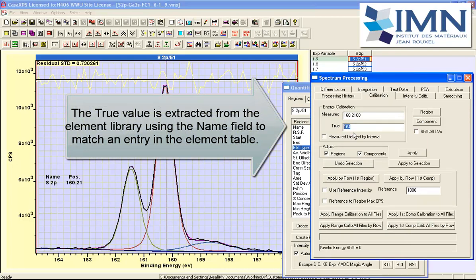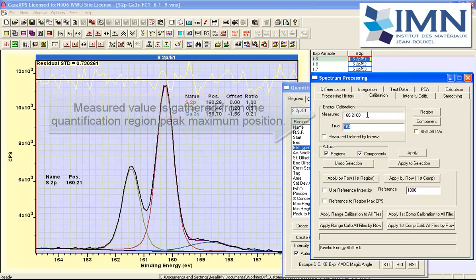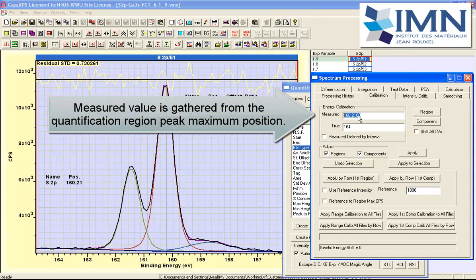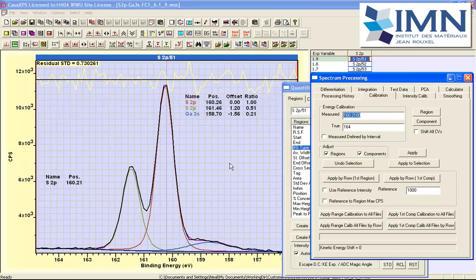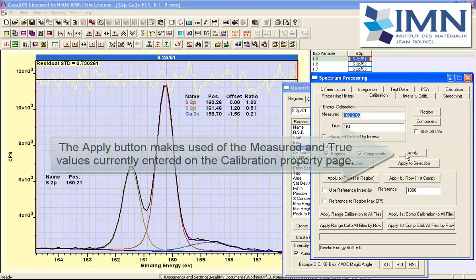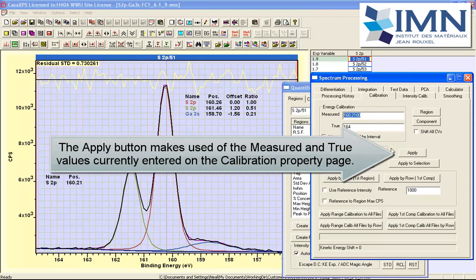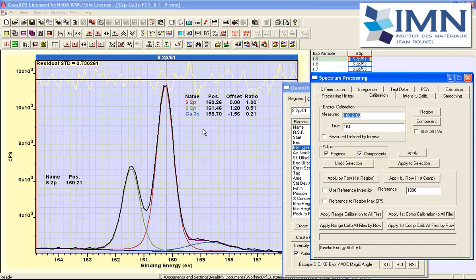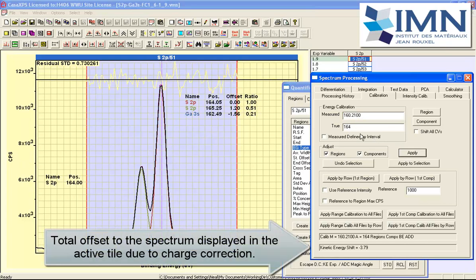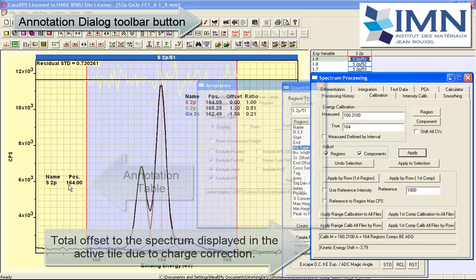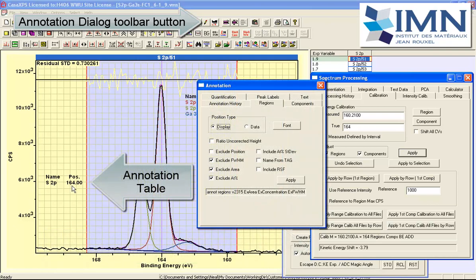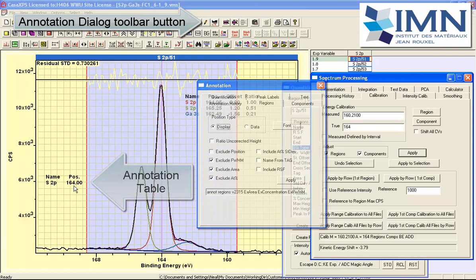So we have a true and a measured value that are entered here on the calibration property page. We have got the regions and components ticked because we want these to shift at the same time. And then it is just a question of saying apply. And the apply button is going to act on the active spectrum in the active tile only. And when I press apply you can see that this table which is a regions table indicates the position of the region and it now matches the true value.